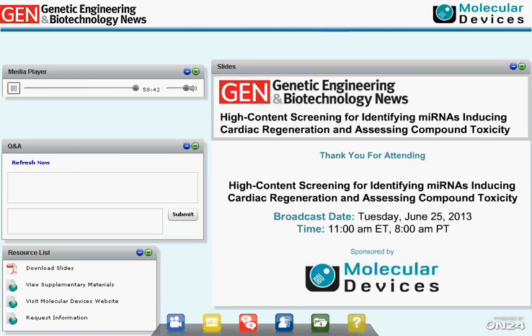All right, Vicki, we're going to go back to you with that question 16 that no one else wanted to tackle. Do you have any CROs that use your system for cardiac tox on a fee-for-service basis? Can you comment on that? So we do have placements of our systems in several contract research organizations or CROs. However, we don't have information on what services they offer, so I apologize that we don't have more detail on that.